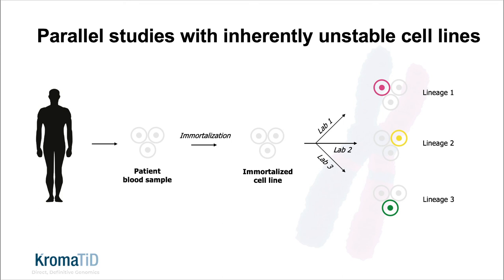The other important thing to note is that this particular phenomena was only discovered by a direct, unbiased, whole genome single cell technique, DGH screen.